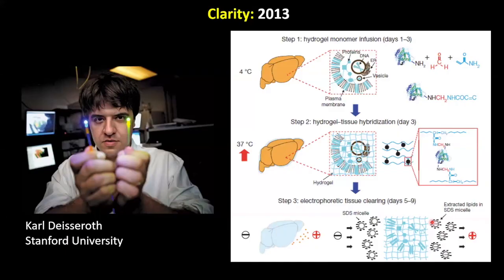And in 2013, Karl Deisseroth's lab at Stanford University pioneered a technology called CLARITY. But this technology only applies to fixed samples, whereas multi-photon or two-photon can apply to live animals, for example. They cleverly found that by chemically removing the lipids in the tissue, and after matching the refractive index, the tissue becomes totally transparent. The process takes a very long time, for example from beginning to end about 9 or 10 days to get the results.